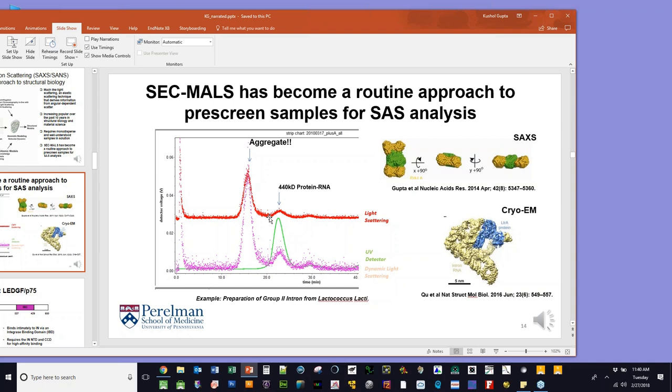So getting rid of that contaminating component is most important in doing these types of analyses. We're looking at the summation, the intensities of component parts.